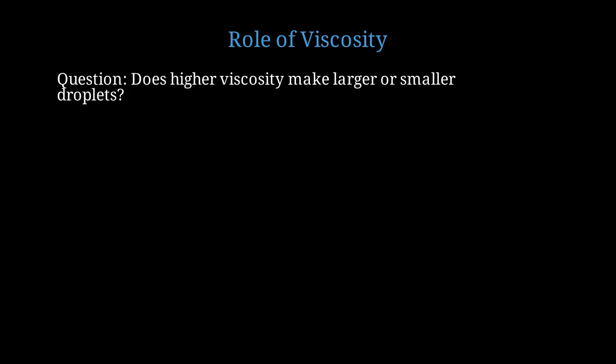Let's dig deeper into how viscosity affects droplet formation. This is often counterintuitive. Here's a question. If you increase the viscosity of the continuous phase, do you get larger or smaller droplets? Think about it for a moment. The answer is it depends on which regime you're in.